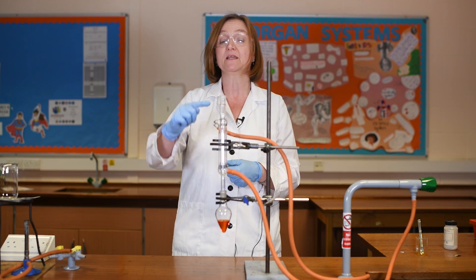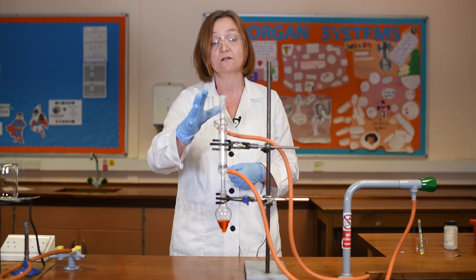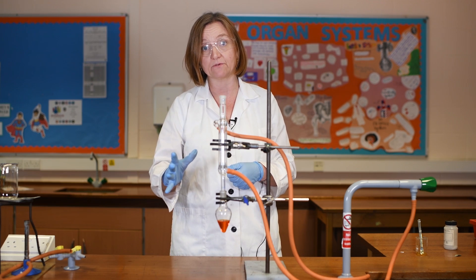One thing I should have mentioned earlier is that I have not put anything in the top of my condenser. This is open — there's no stopper or anything — because if I did close this off completely I would run the risk of building up pressure inside my equipment, which could lead to an explosion.